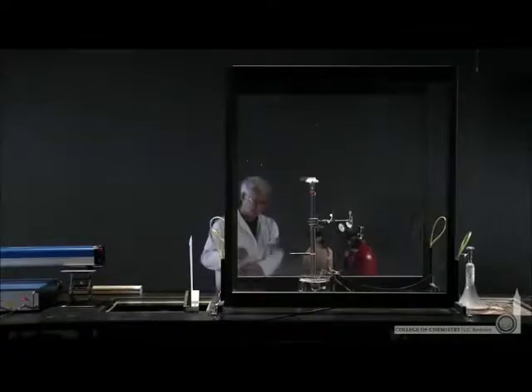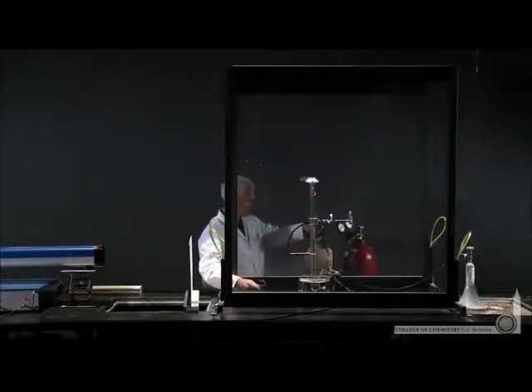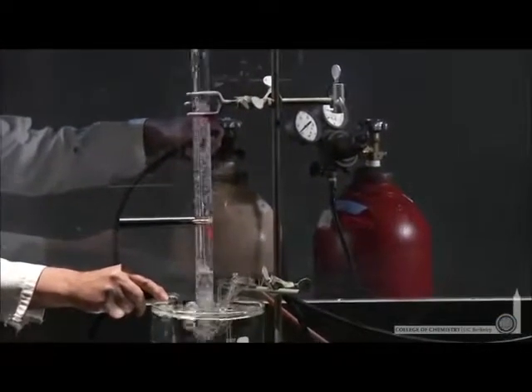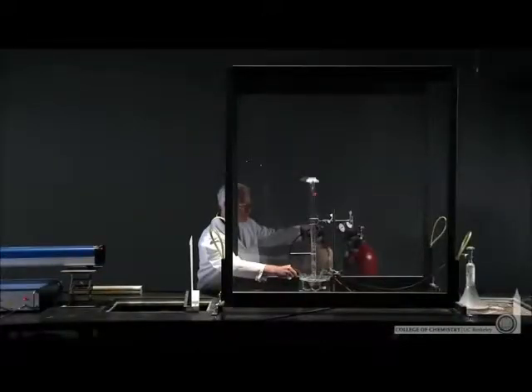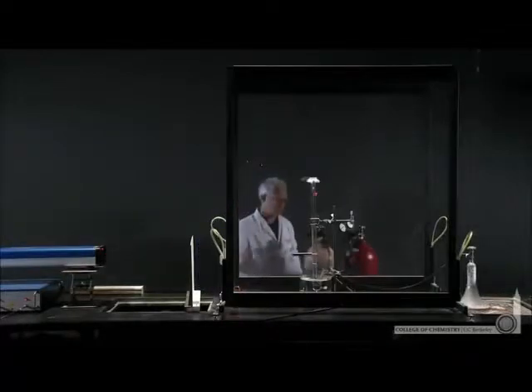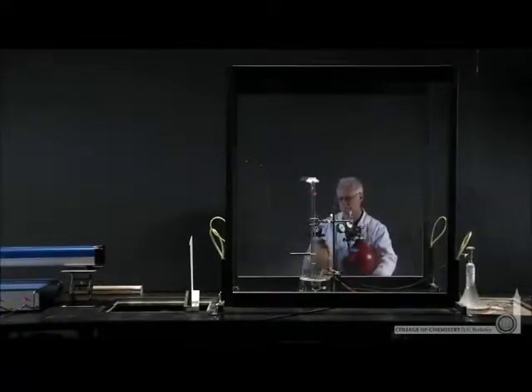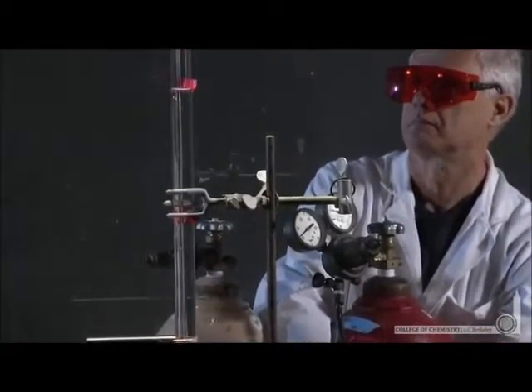We're in the demo lab with Lonnie, and we've asked him to perform a sophisticated experiment where he forms a covalent bond, hydrogen chloride, from hydrogen in its standard state, H2 gas, and chlorine in its standard state, Cl2 gas. In order to do that, he'll first purge this cylinder to remove the air, and he'll purge it with nitrogen. Nitrogen is inert in this chemical reaction. It just serves to remove the oxygen and other gases from the flask. So here he'll purge the flask by allowing that nitrogen to flow through. And now we have a cylinder of mainly inert nitrogen gas.